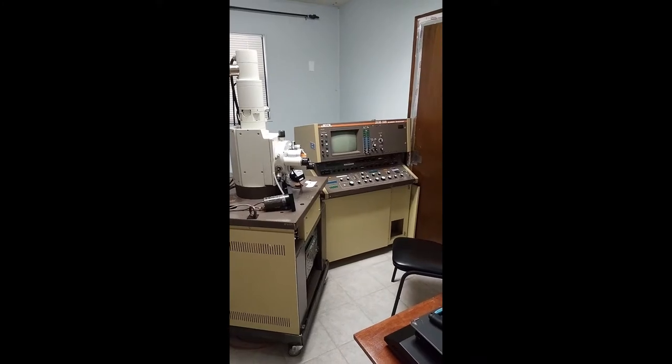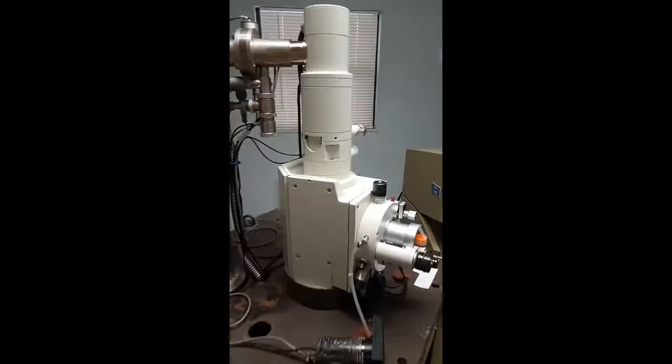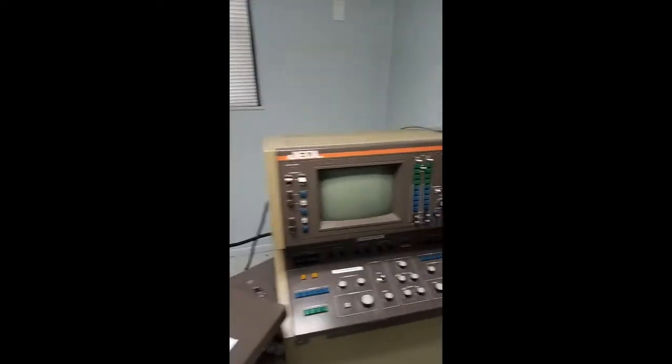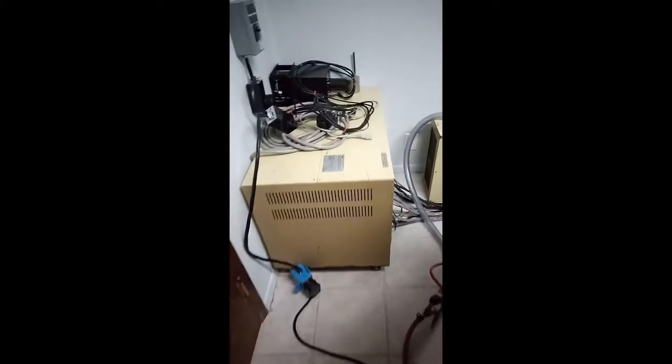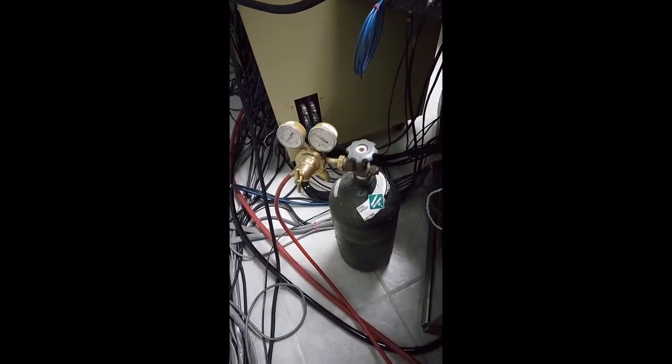Here is the JEOL JSM840. We have the microscope, the console unit, a water recirculation chiller, the power supply, the roughing vacuum pump, and a high-pressure nitrogen bottle.